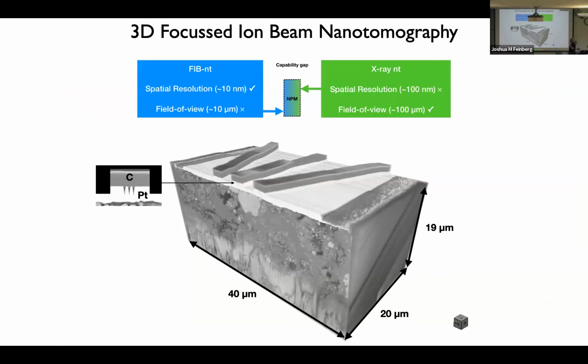So that's everything in terms of 2D. We have a bulk breakdown from the backscattered electron images, the 2,000 images taken across the entire sample. We can understand what it is we're seeing with EDS. We can take those EDS segmentations and use that as training data for the first stage. And then the next thing is to look at individual regions of interest and characterize in very fine detail the magnetic properties, or the magnetic particles, contained within certain regions.